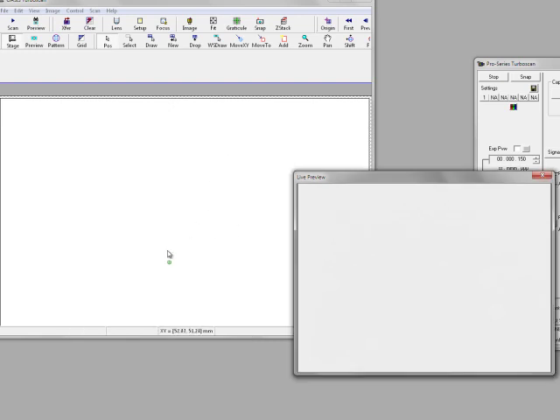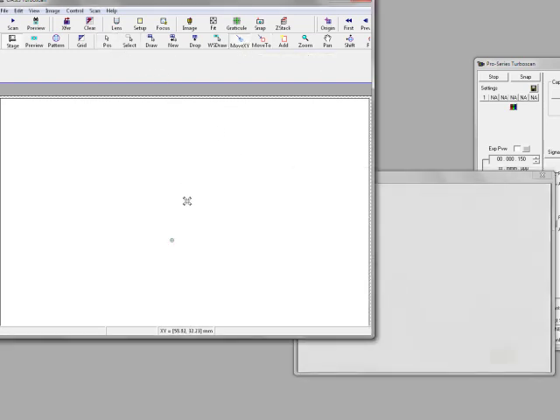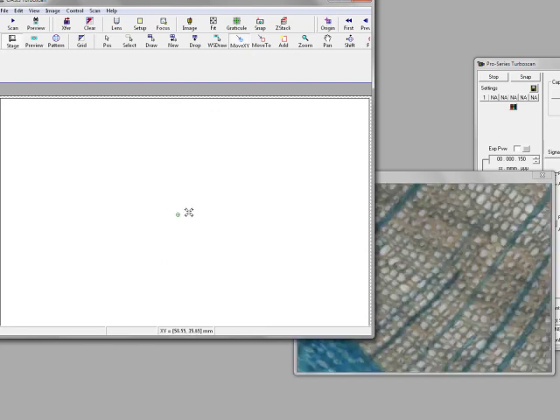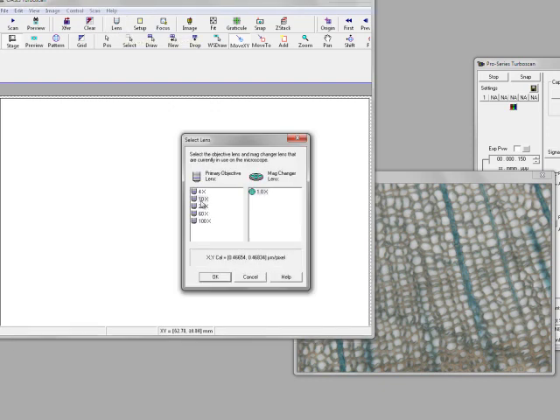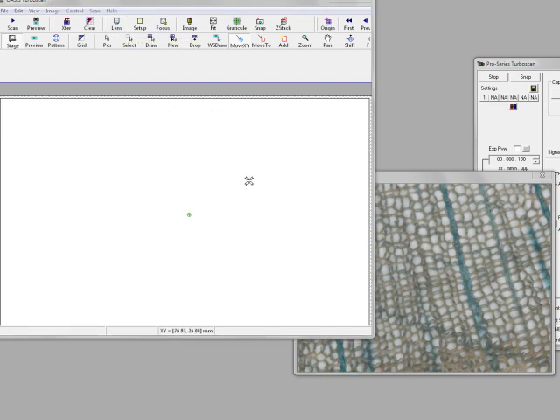We now see we're actually here, so about the slides around here. So I can move back using a joystick, or actually I can say move X, Y to stick me straight in the middle, drive around the stage like that, which is pretty straightforward. So now I want to take a scan. So first thing, just going to make sure that I'm on the 10x that I am. That's required to know that we're moving the correct distances.